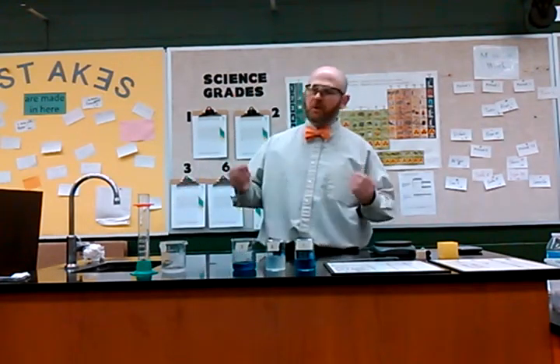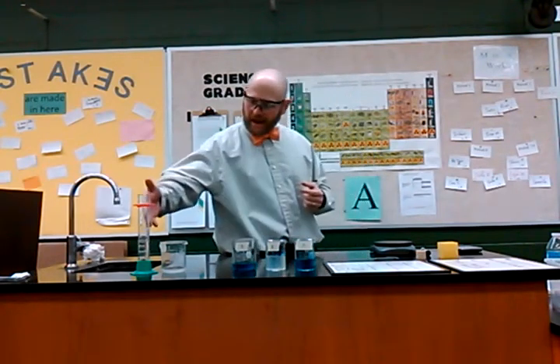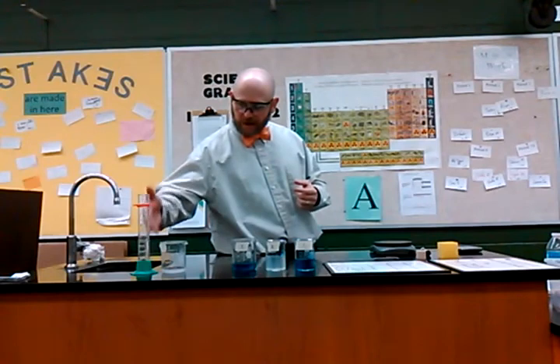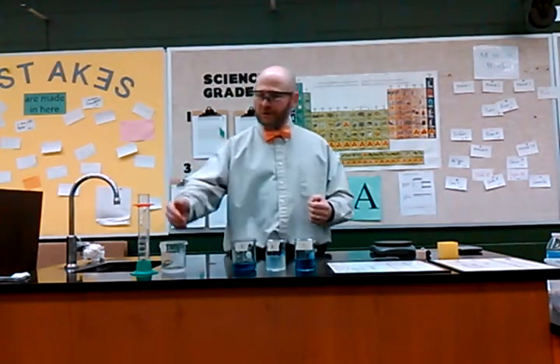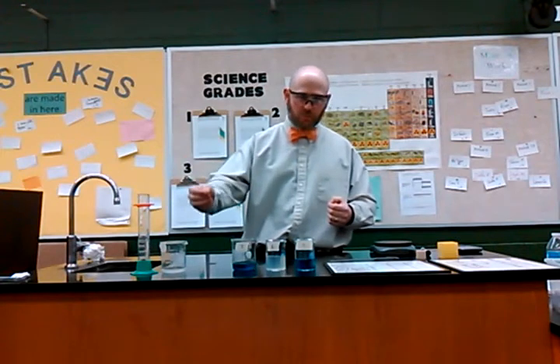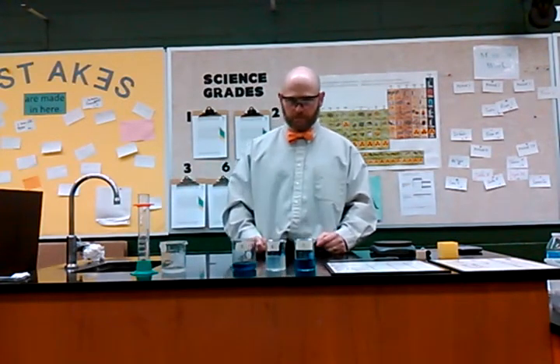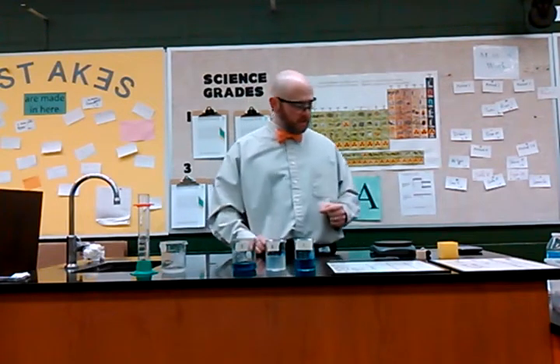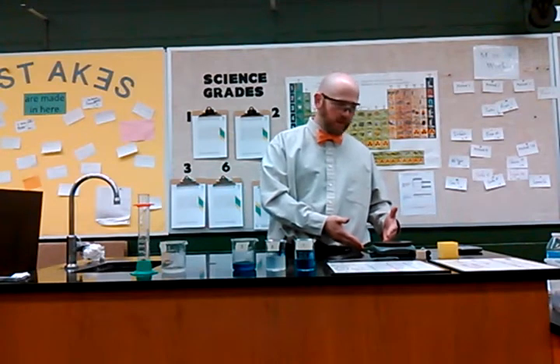One of the things that could be a source of error in this is that I have used a graduated cylinder, but I didn't dry it out every single time. So that could change the amount of actual fluid that I deposited into these other beakers. Another source of error is the fact that my scale only goes to the nearest gram.